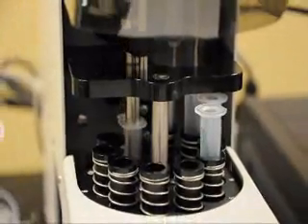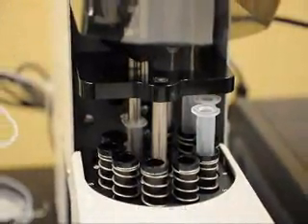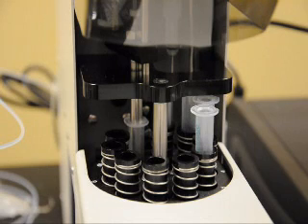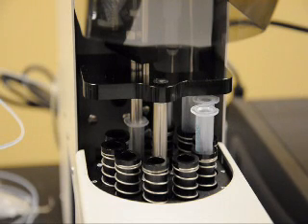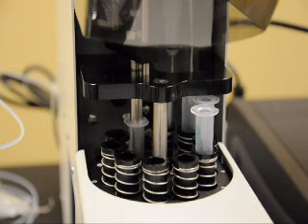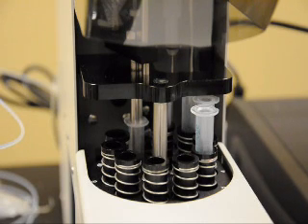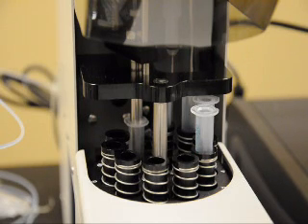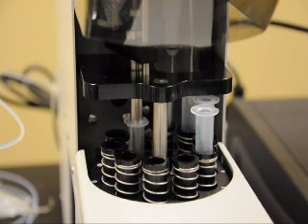The system is now aspirating the methanol that's going to be used for the conditioning step. And then it will push the methanol through the SPE column at the specified flow rate through the SPE column and out to the organic portion of the waste station.